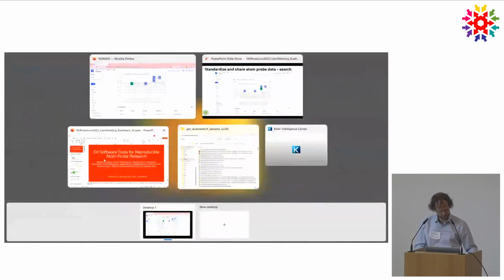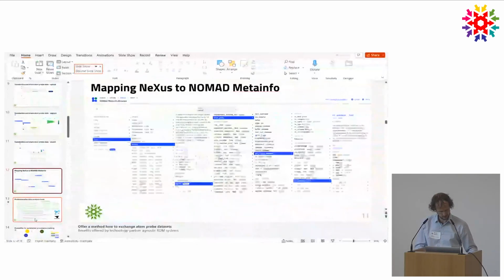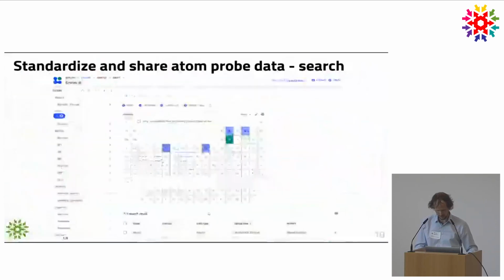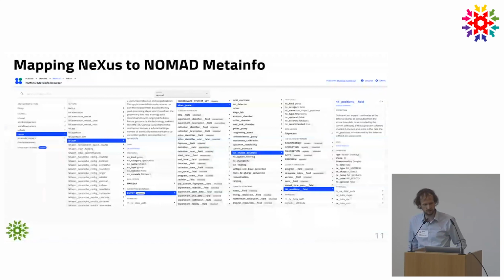And again, so I think I should also converge towards an end, and I think I'm getting there. People often ask us about interoperability. In NOMAD, at least from a historical point of view, there was always this NOMAD, and there is still this NOMAD Metainfo, which is used. And in fact, Chandra and Theodore and Markus spent quite some time to write a generic parser to parse from NeXus internally towards NOMAD Metainfo.